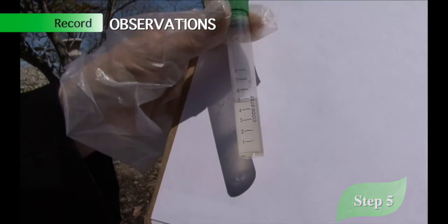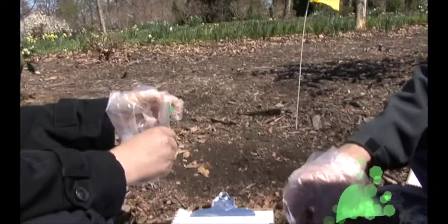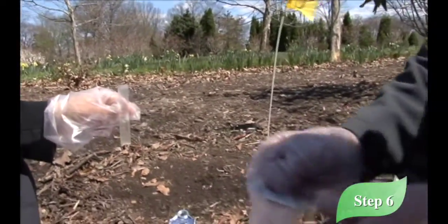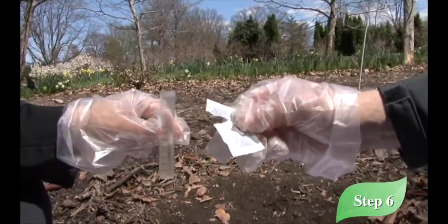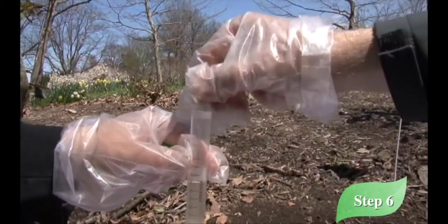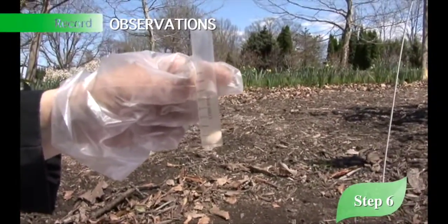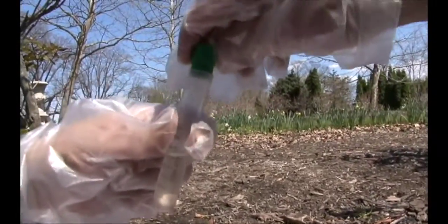A little bit. All right, in step 6, we're supposed to add 1 potassium indicator tablet to the soil extract in the second tube. So can we go ahead and grab one? In your kit, you'll find little tablet packets. You'll rip one open, take the tablet out, put it inside the container. In step 6, you're going to start recording what you see, and you'll see that there are little bubbles starting to appear. We're going to cap it.